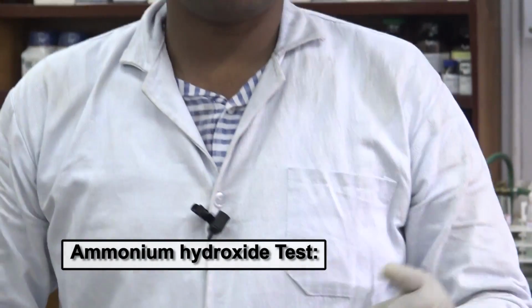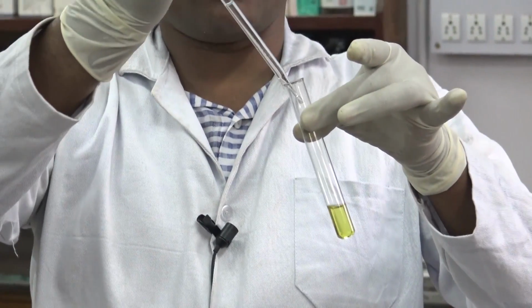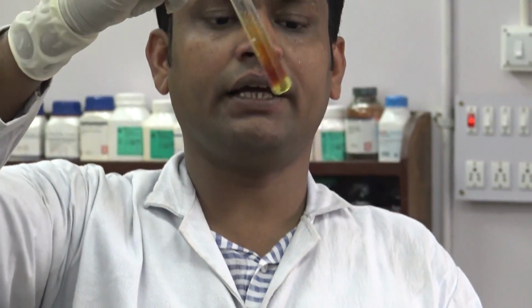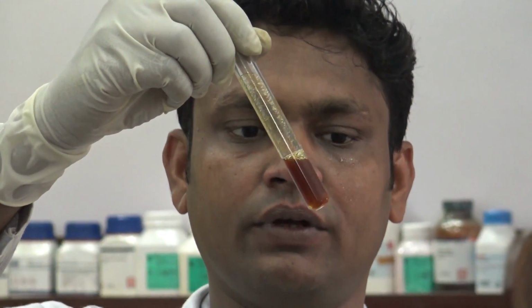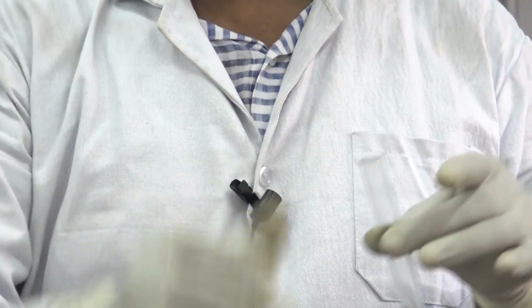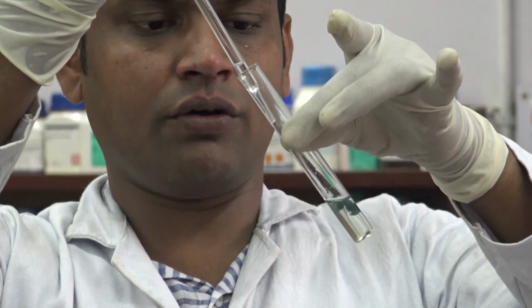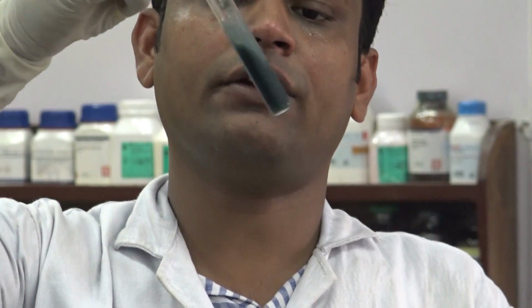For this test we have to take the sample solution and add few drops of ammonium hydroxide into it. The brown precipitate indicates the presence of ferric ion, that is Fe3+, and in case of ferrous ion we will get dark green or pale green precipitate using ammonium hydroxide.